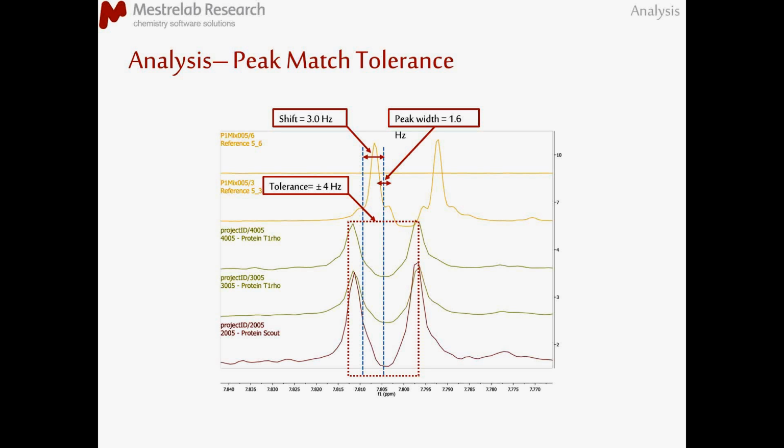So in this sense, we want to have a good compromise value that is, like I was saying, neither too small nor too big. With too small of values, we may end up having an excessive number of false negatives. If we increase the value too much, we may end up on the other side, having too many false positives.